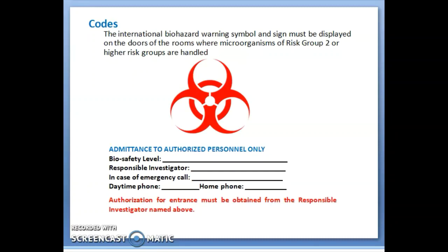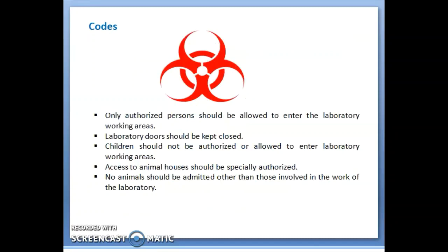Authorization for entrance must be obtained from the responsible investigator named on the admittance card. Only authorized persons should be allowed to enter the lab working areas. Lab doors should be kept closed. Children should not be authorized or allowed to enter laboratory working areas. Access to animal houses should be specially authorized, and no animals should be admitted other than those involved in the work of the laboratory.